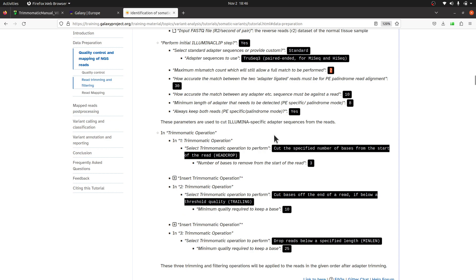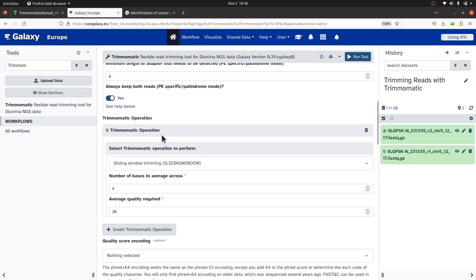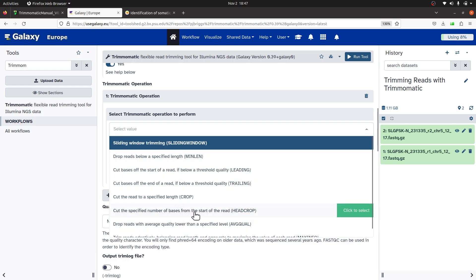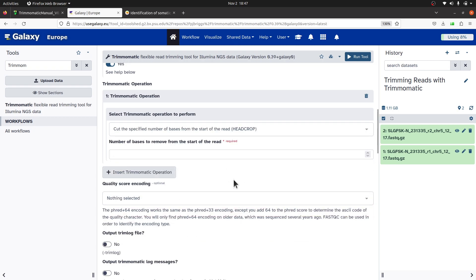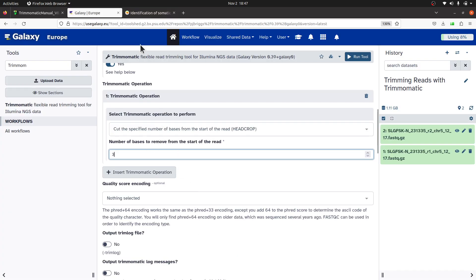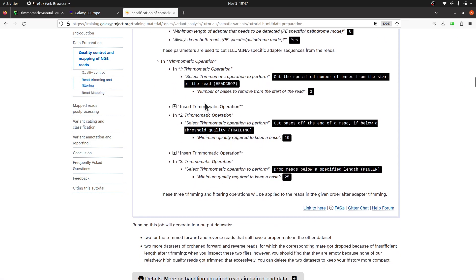Now we also have Illumina-specific trimming parameters — the Trimmomatic operations. The first operation is HEADCROP: cut the specified number of bases from the start of the read. Select HEADCROP and set the number of bases to remove from the start to 3. Let's get back to Trimmomatic operations, click and select the HEADCROP option, and set the value to 3.